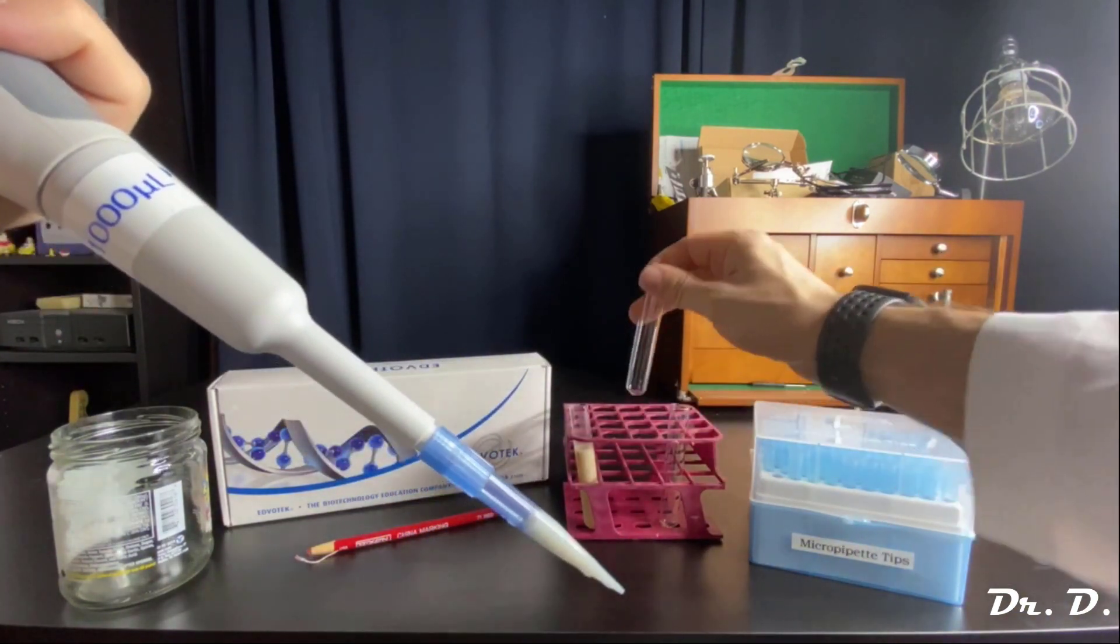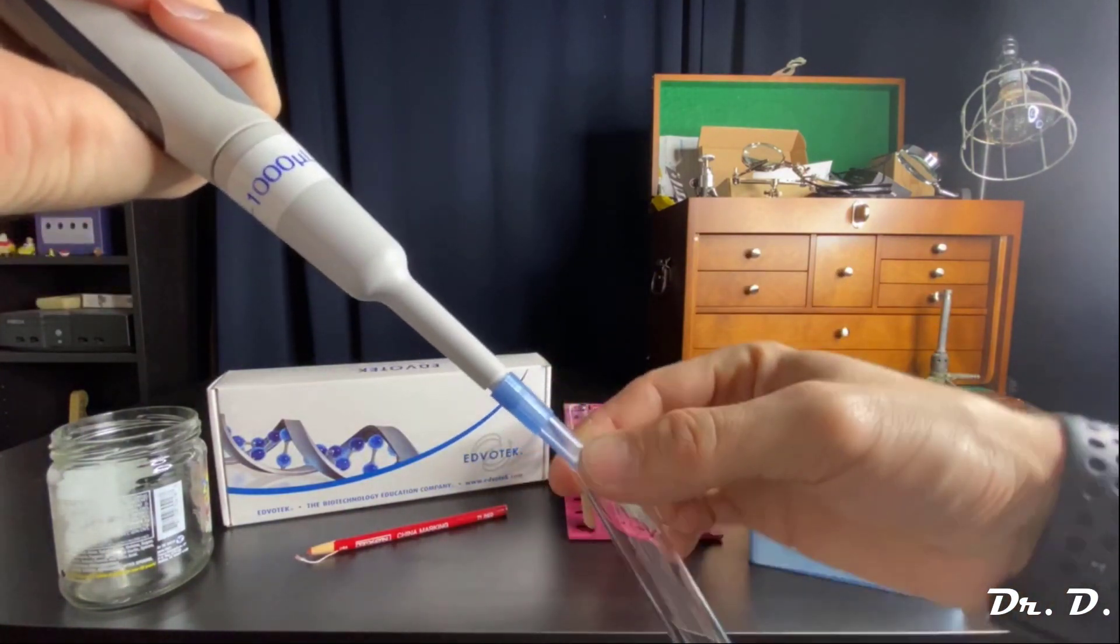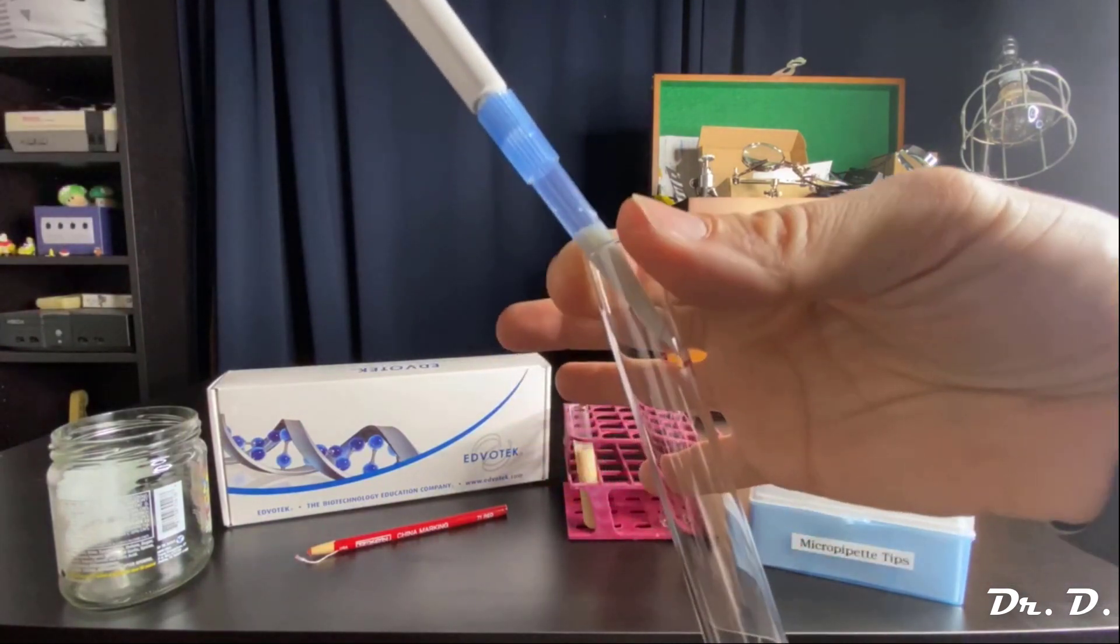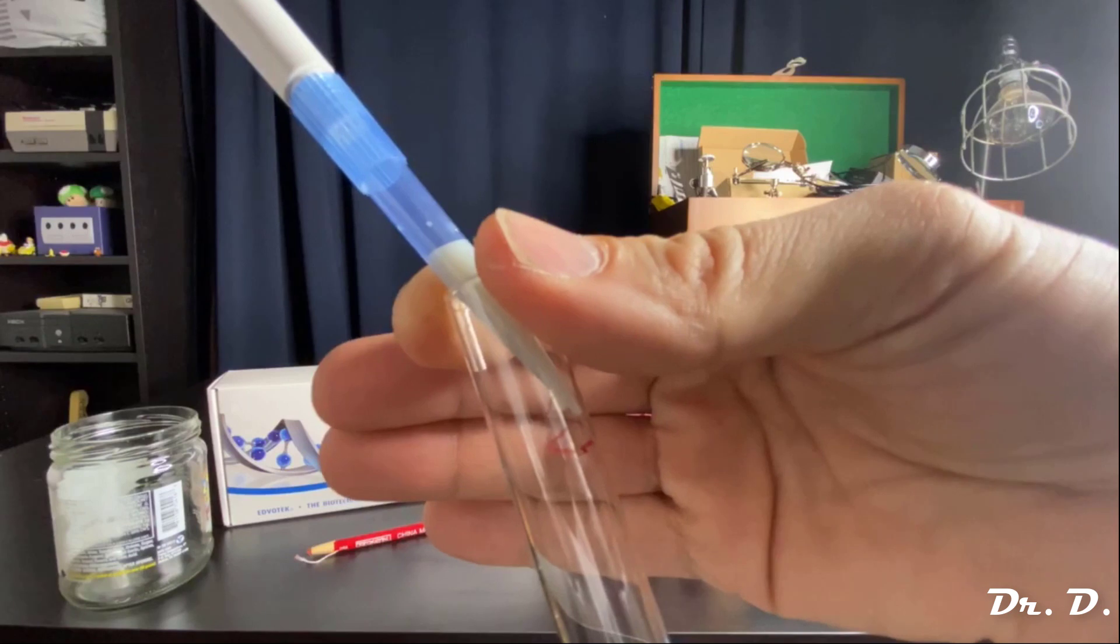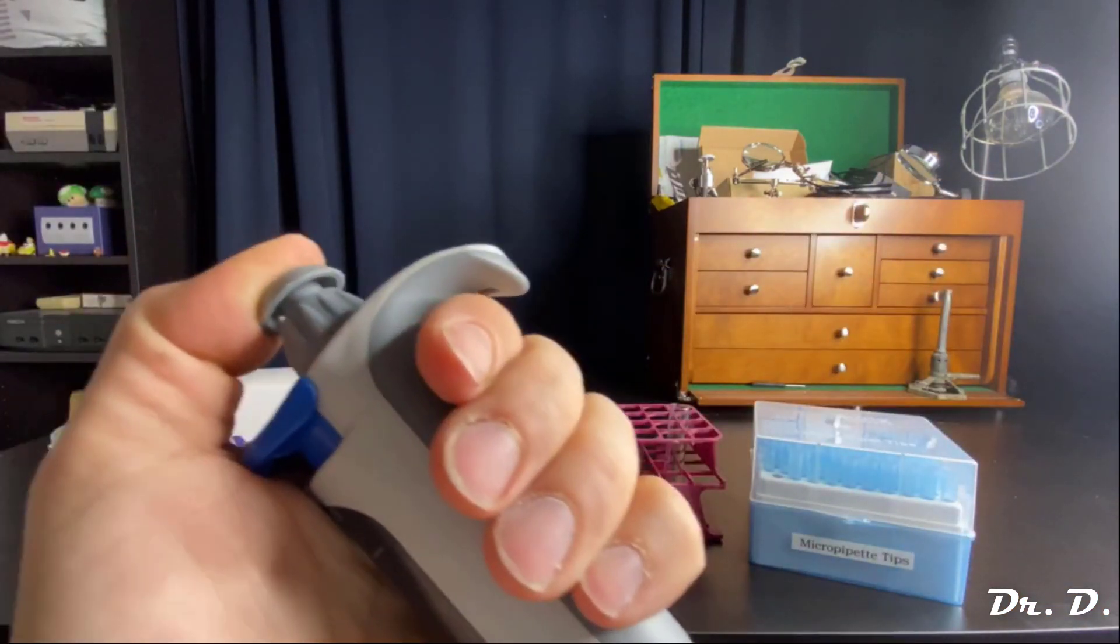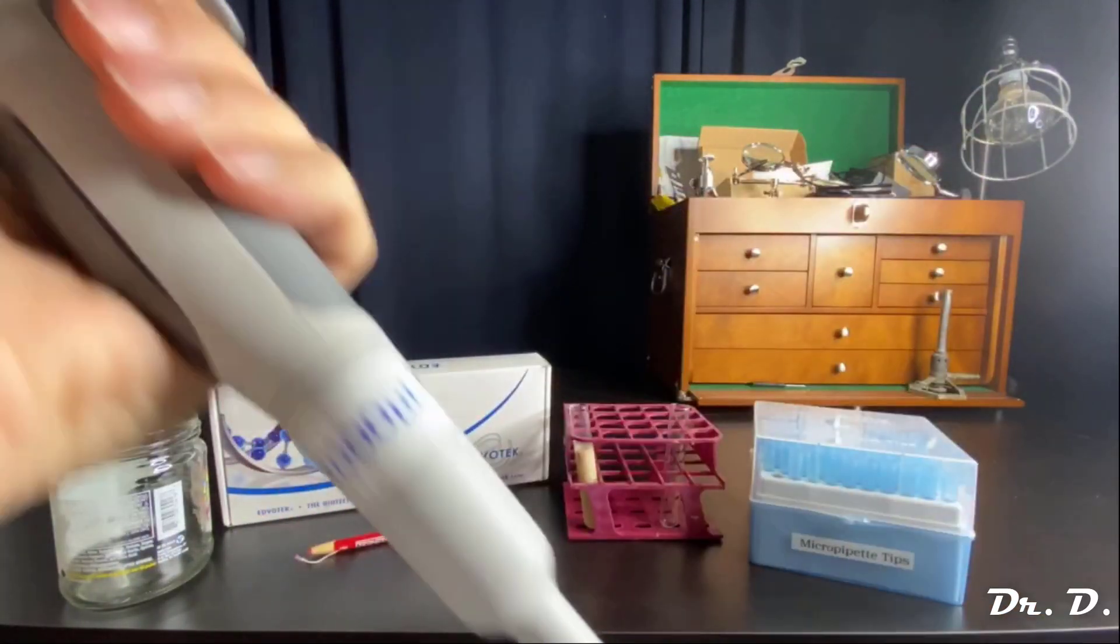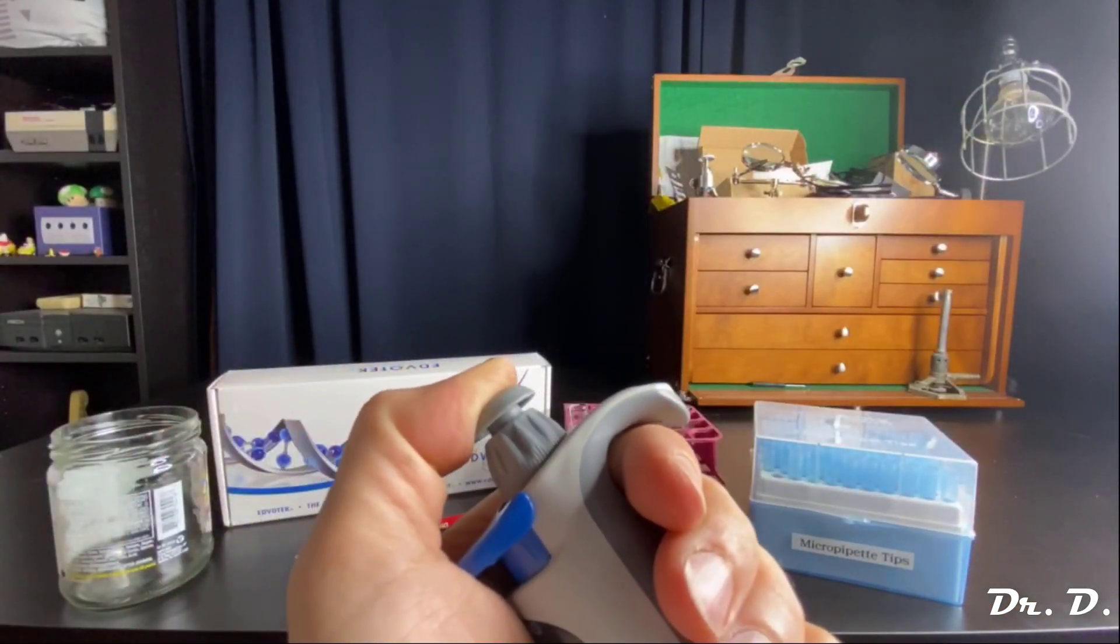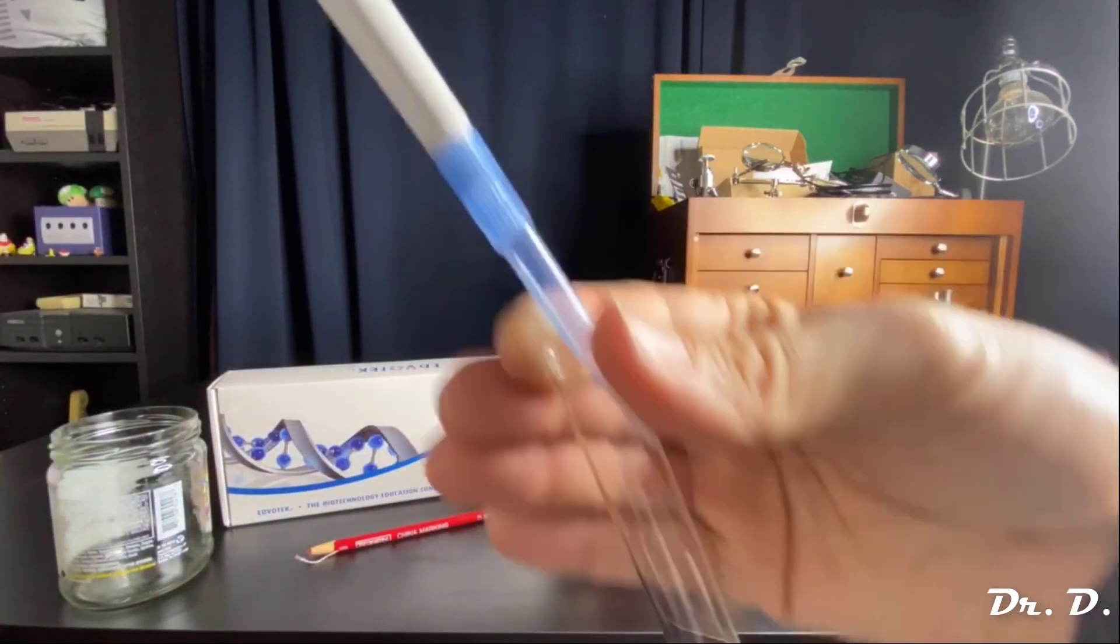Let me grab test tube two. And what do I do? I gently touch the side of the pipette. You can see here. I just touch the side to the glass. And then I very gently push down. Now watch. I push down to the first stop. And that evacuates most of the solution. But then I push down to the second stop. And that evacuates the rest of the solution.